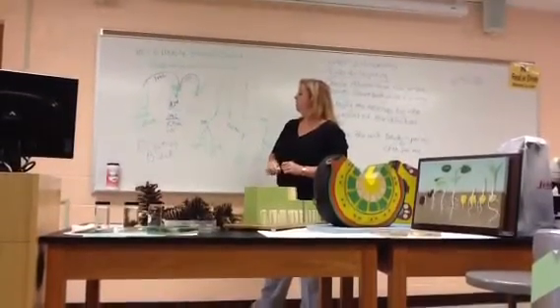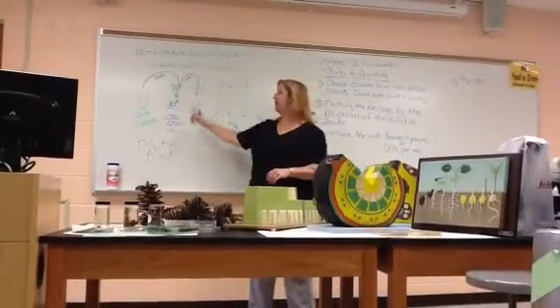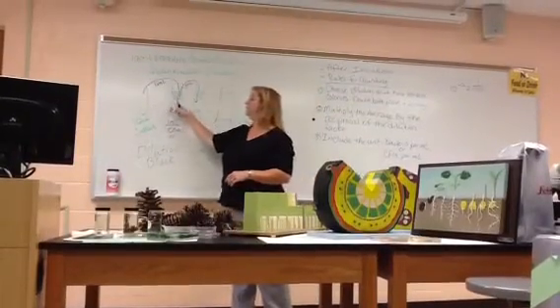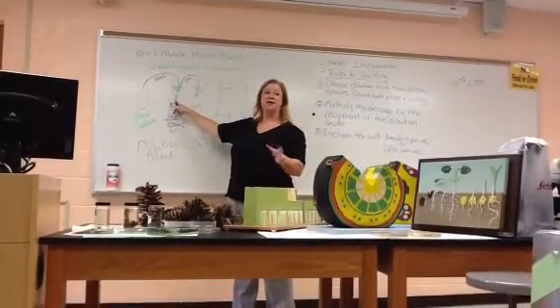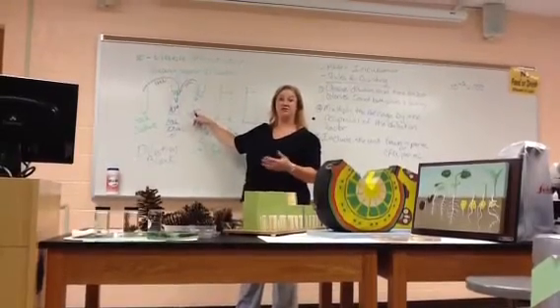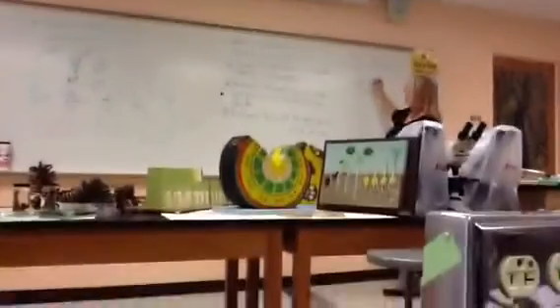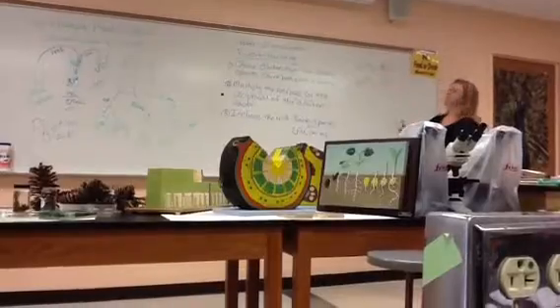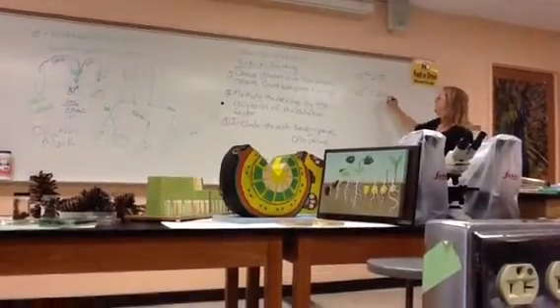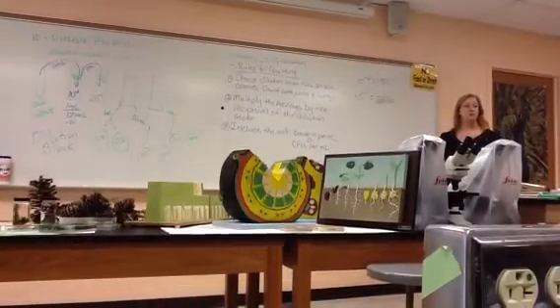So, this is the 10 to the minus 4 dilution, because we've done 100 mls twice. Right? We moved 1 ml into this dilution blank, shook it up, got a new pipette, moved a ml from this dilution blank to that one. So we've got 2 sets of 100. 10 to the minus 4 dilution would mean 1 over 1 with how many zeros? 4. We just made a 1 in 10,000 dilution. Does that make sense? We did 100 twice.